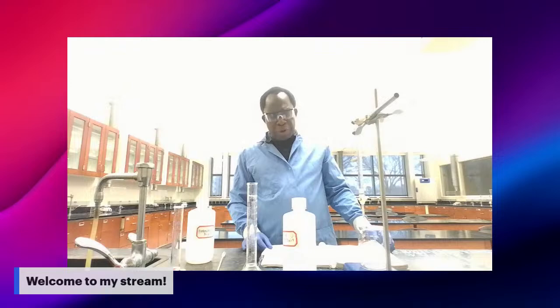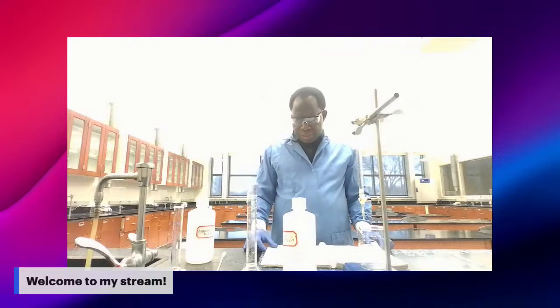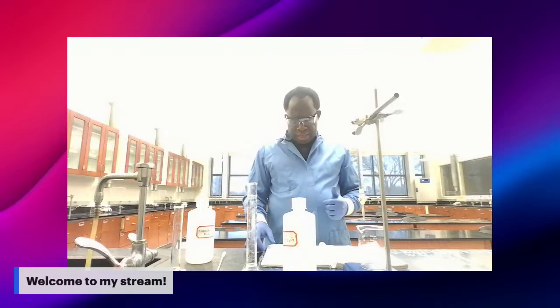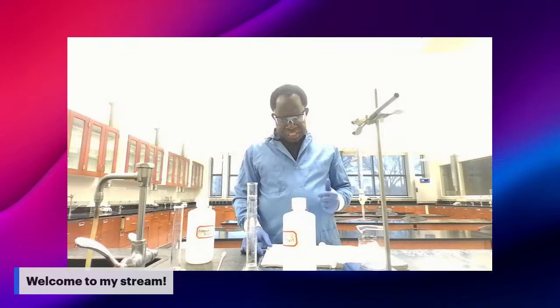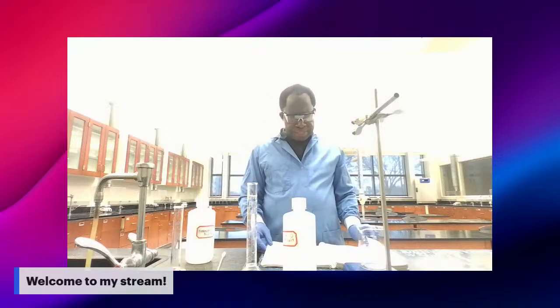What is the reason for drawing a titration curve? The curve will allow you to determine the equivalence point, the half equivalence point, the pKa, and the acid dissociation constant of the unknown acid.